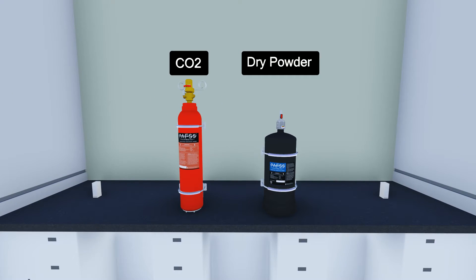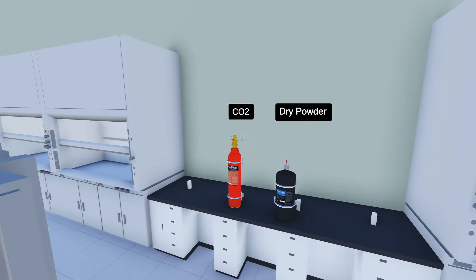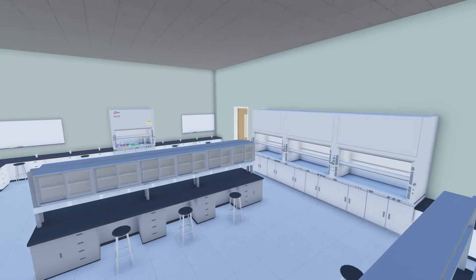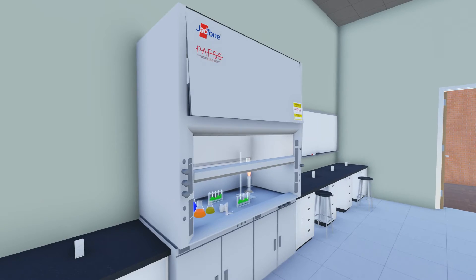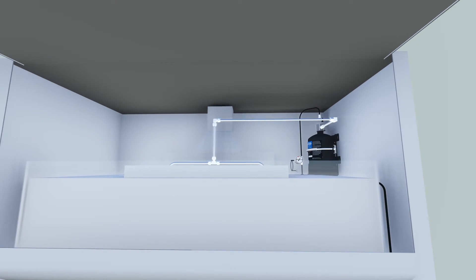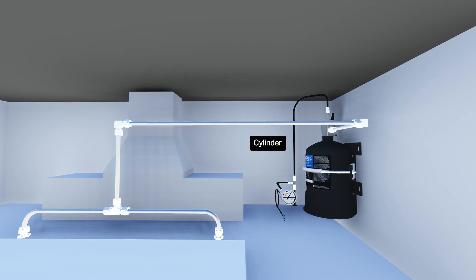PAFS is available with dry powder or CO2 extinguishing mediums. It can be installed to new fume cupboards and retrofitted to existing fume cupboards easily. Cylinders can be mounted at high or low level to fit seamlessly within the frame of the fume cupboard.